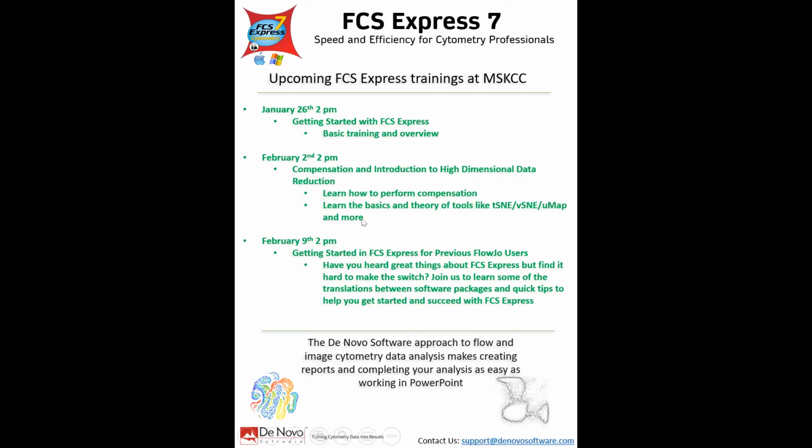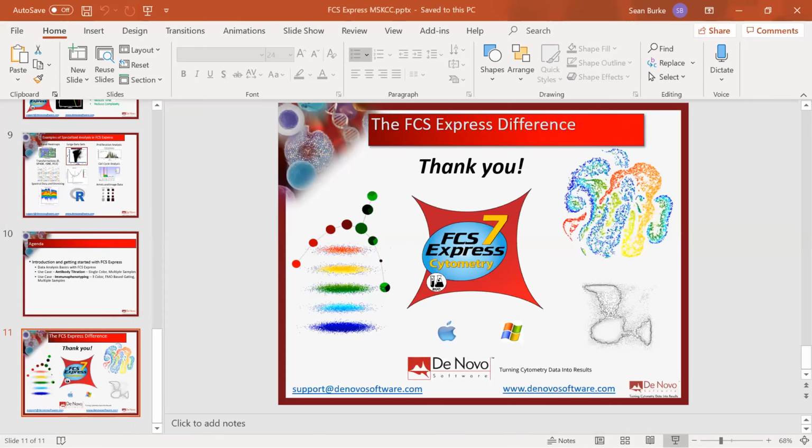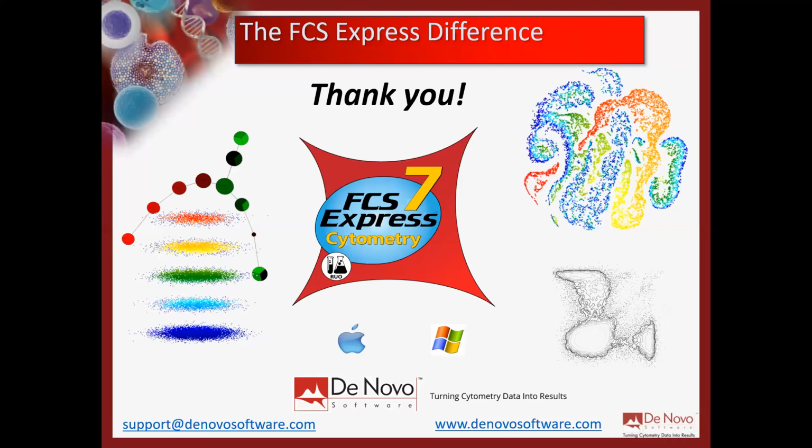If we had any folks here that were previously FlowJo users, or they're currently FlowJo users and they're looking to transition a little bit more into FCS Express, just like in the beginning, I mentioned a little bit about some of those translations, right? So we don't call things a zebra plot in FCS Express. We call it a contour plot with black and white stripes, right? We don't have the table editor. We have our spreadsheets. So I'm going to go over some of those things, and that way it's going to make folks a little bit more comfortable coming into FCS Express, even if you've been working with another software package for a long time. Will help you make some of those translations and answer your questions.